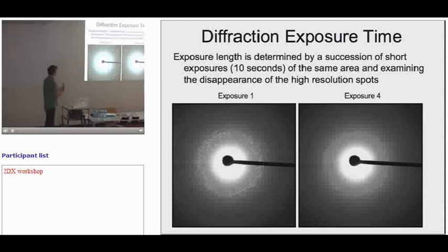So what I would do is say 10 plus 10 plus 10 is 30, so I would take a 30-second exposure. I didn't show exposures 2 and 3, but those you could very faintly see this. It's almost there, but at this point it's too burned to be useful. So I would take a 30-second exposure for this.